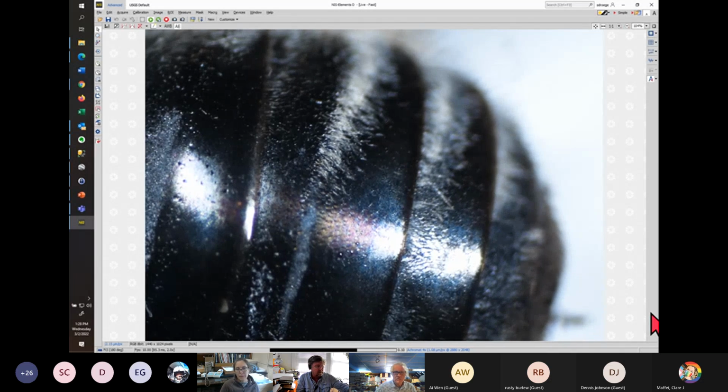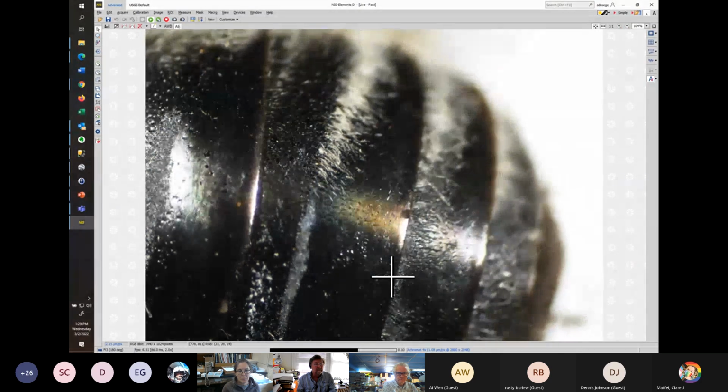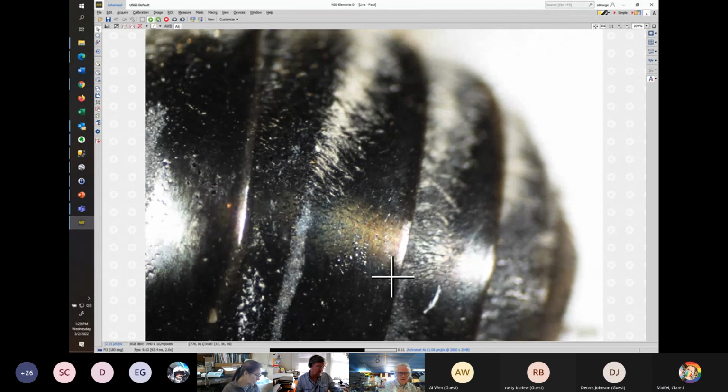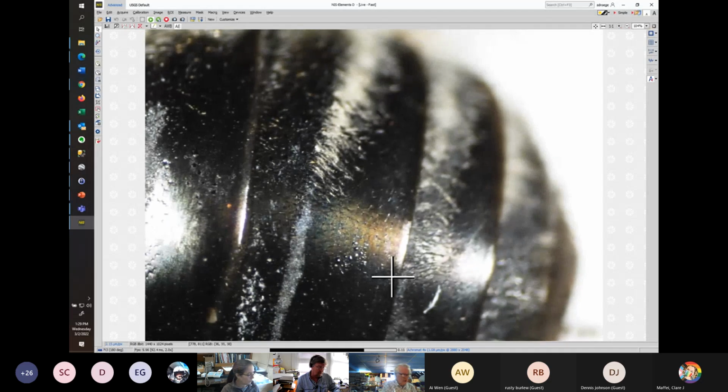So the hair bands are definitely not complete across the entire segment. And then you have that super wide apical area with no pitting on it, or very light few pittings. And what species do we have there? This is denticulatus. Thanks. And so that's a good character for separating out.